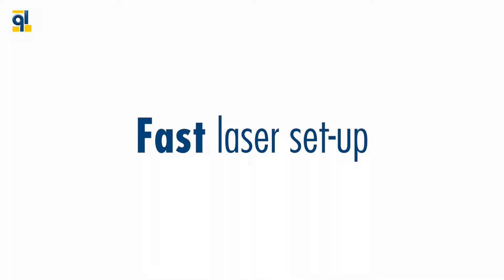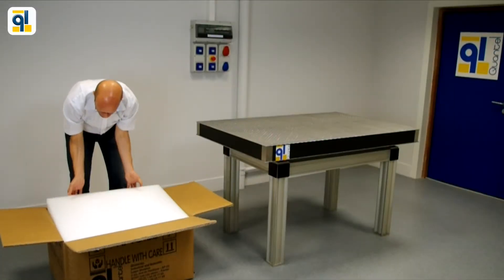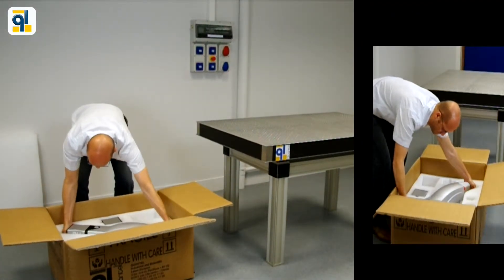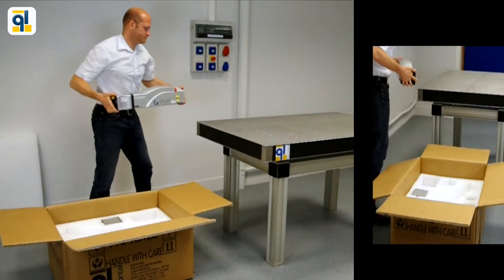Let's focus on fast laser setup. Out of the box, in a couple of minutes you can start the experiment right after 15 minutes of warm-up time.